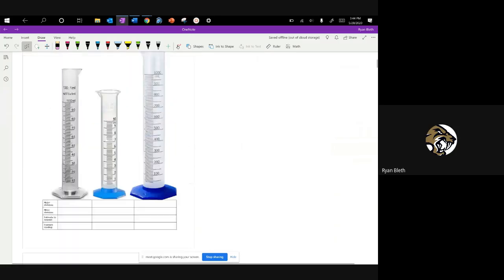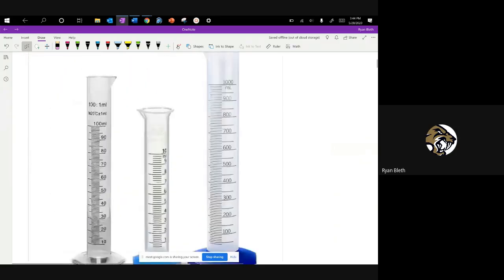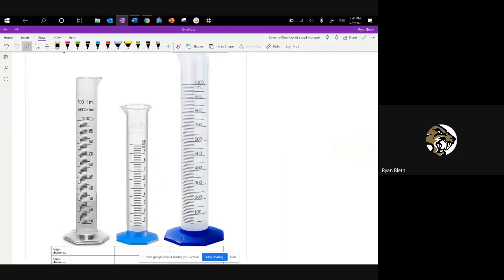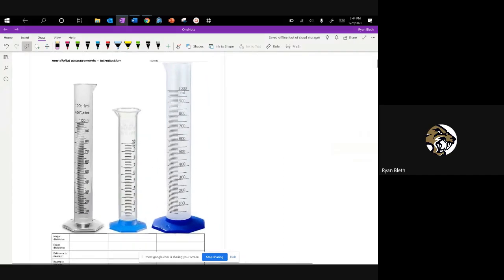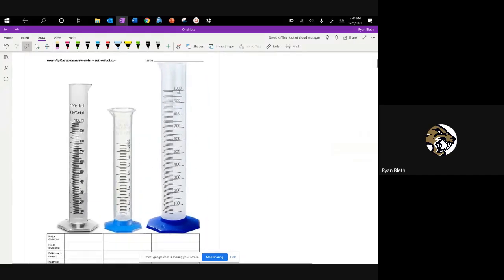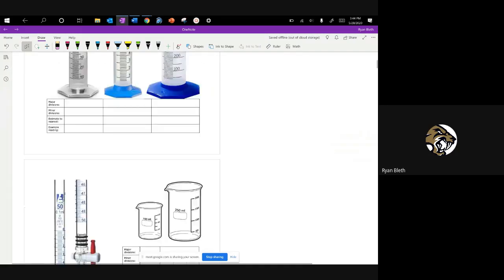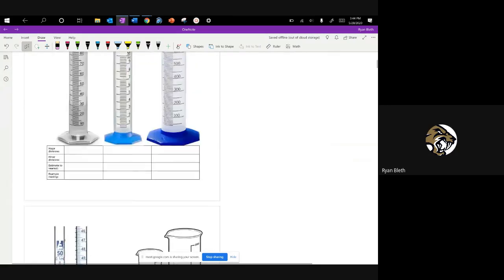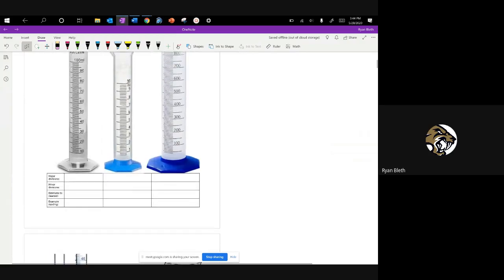I've got several graduated cylinders here that are all different sizes, different capacities. You may have worked with many of these before. I've got one here that's 100, then 10, and then 1,000 milliliters. And then on the next page, a few other devices that have different capacities and different graduation lines on them as well.